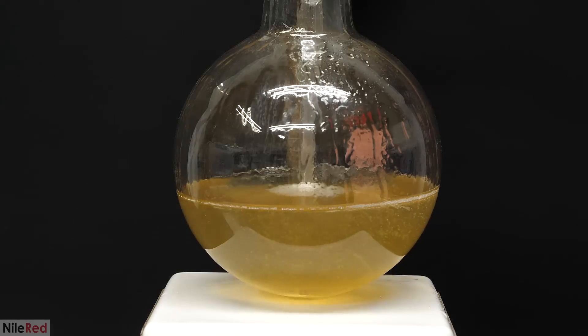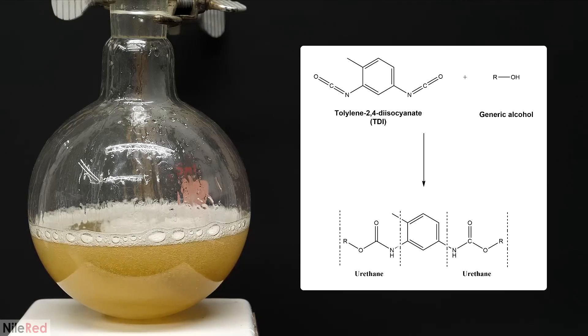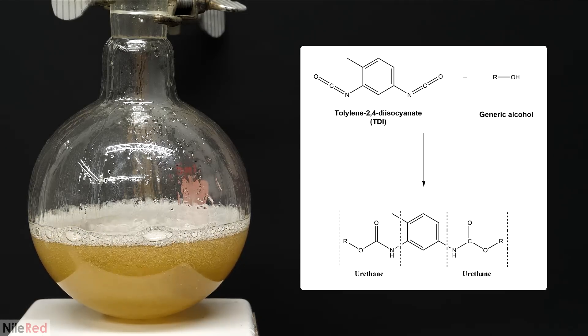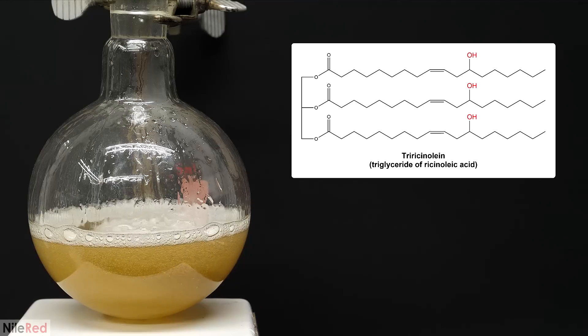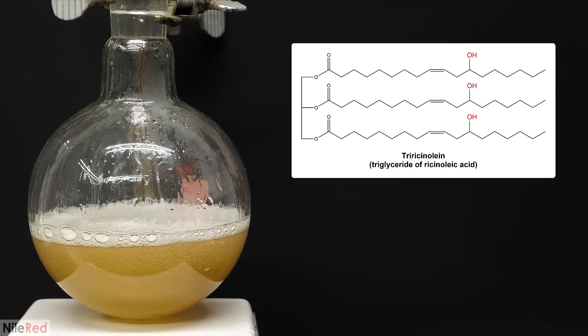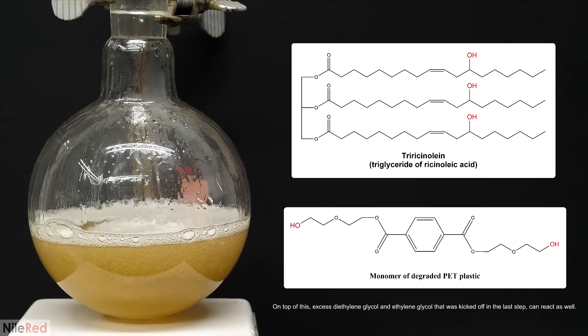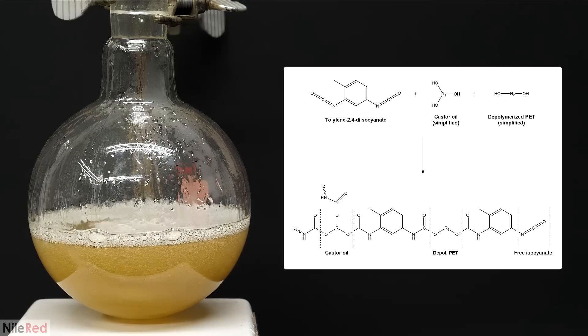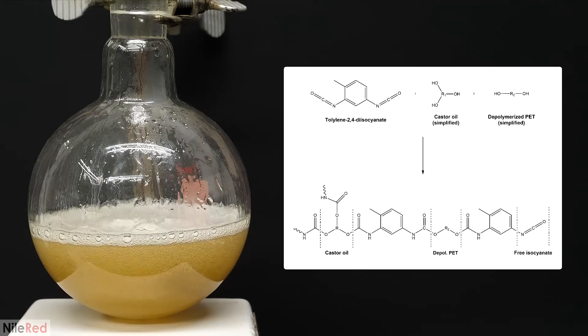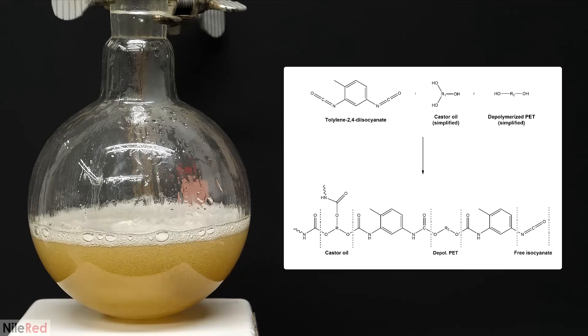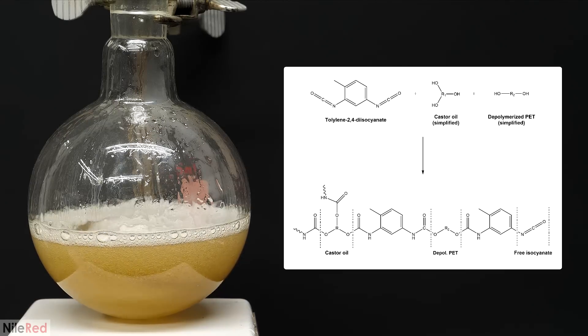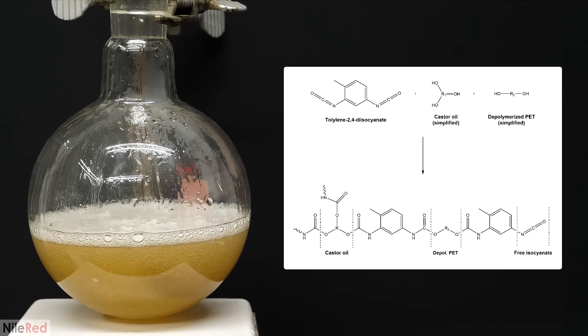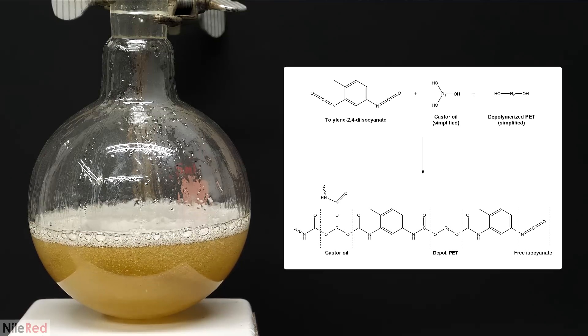Over the next 20 minutes or so, the temperature slowly rose and it started to bubble. The TDI has two isocyanate groups and each of them can react with an alcohol to make a urethane. The castor oil that was added is almost entirely a triglyceride of ricinoleic acid and it can react in three places. Also, each fragment of the depolymerized PET can react on either end. With all these ingredients added together, the castor oil and the PET fragments start attacking the TDI. This builds a new polymer chain containing many urethane groups and it's generally referred to as a polyurethane. An excess of TDI was used here though, so it didn't fully polymerize and most of the strands didn't get very long. A lot of them also have free isocyanate groups on the end and you'll see in a bit why that's important.